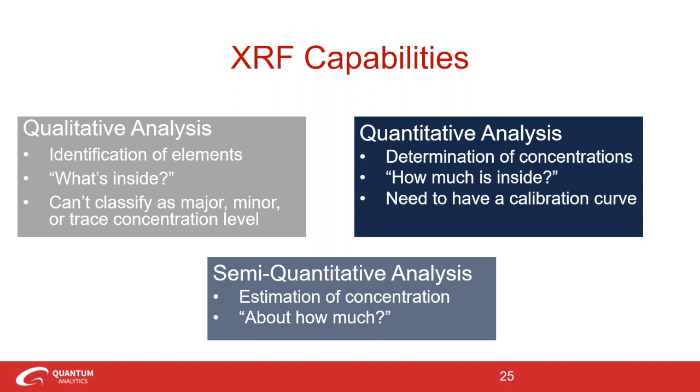With a little bit of caution here, I'll say it can operate somewhat like a black box, right? And it does. What you see though is what you get, right? And it allows for you to interactively evaluate your data. But think of it as giving you some ballpark figures, right? So we say semi-quantitative, meaning approximate information.